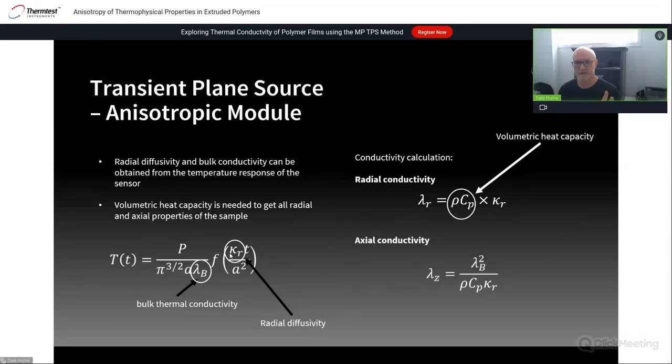With calipers, you measure the thickness and the sample dimensions. You can get the available probe depth in both directions. We want to make sure that the assumptions are met, that we stay within those two directions, which is just based off the change of time.